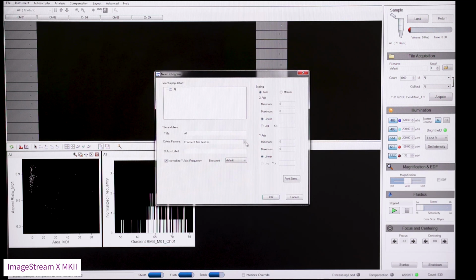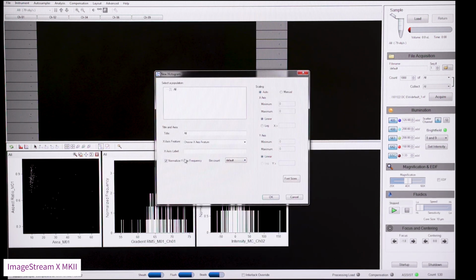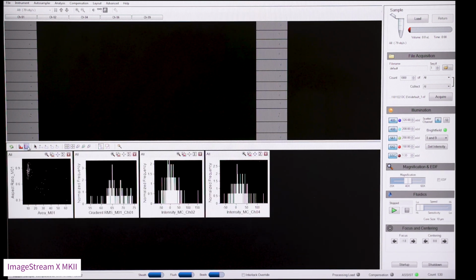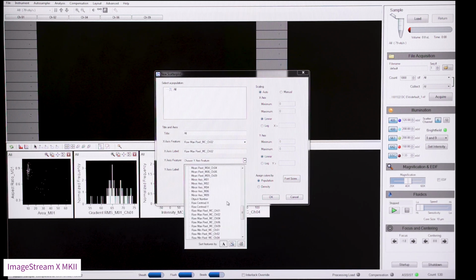In this first example, we're going to look at cells stained with FITC, which is in channel 2, and propidium iodide, which is in channel 4. So I'll go ahead and create histograms for those two channels. And then I will create a scatter plot where the X-axis feature is raw max pixel for channel 2 and the Y-axis feature is raw max pixel for channel 4. The raw max pixel values will help us check for saturation.